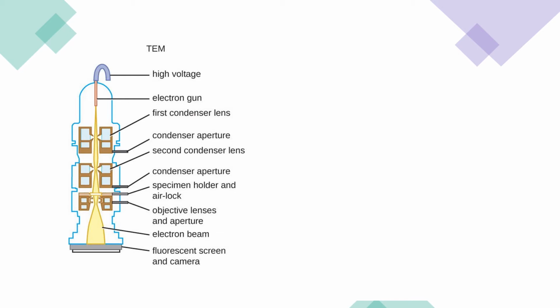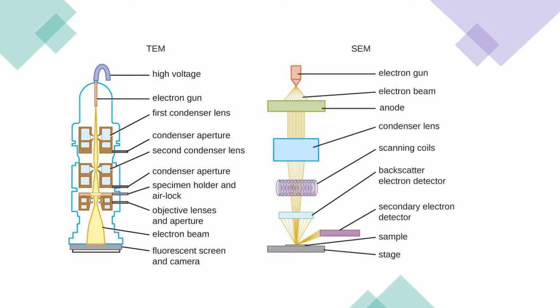It's important to note here that this entire process takes place under vacuum, and the apparatus is fairly bulky in reality, which I'll discuss when we discuss the advantages and disadvantages of these equipments. For now, let's look at the SEM apparatus.